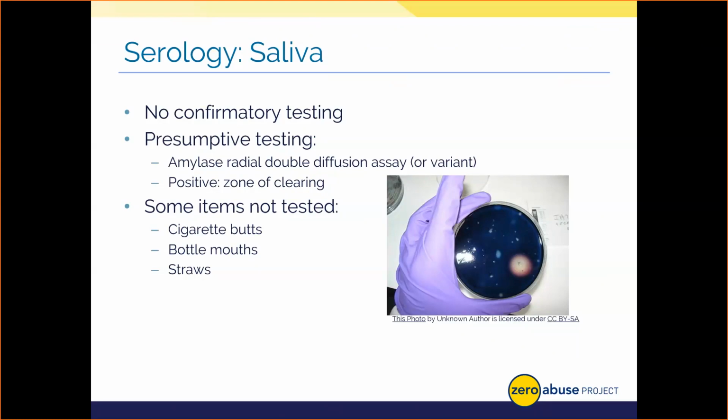Now, we can add a small cutting and some nuclease-free, otherwise known as DNA-free, water directly to these wells. Or what we can do is add a cutting of a sample to some water, and let it soak in that water to slough off the body fluid off of the clothing or material or fabric on which it's deposited. That liquid with the potential body fluid or the cells inside of it is known as an extract. So you can directly add the extract to each sample well too, but just know that an extract has the potential to dilute a stain, since you're adding it to water to then pull the stain away from the material in which it was deposited.